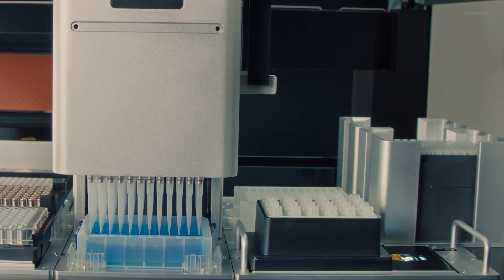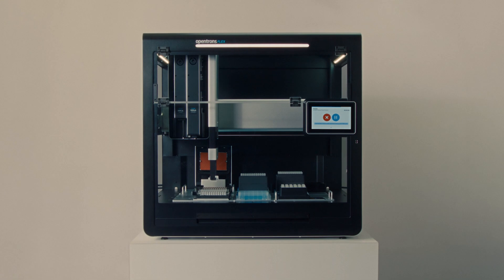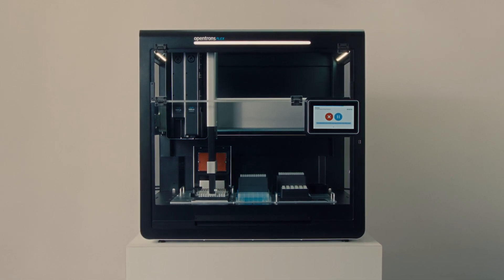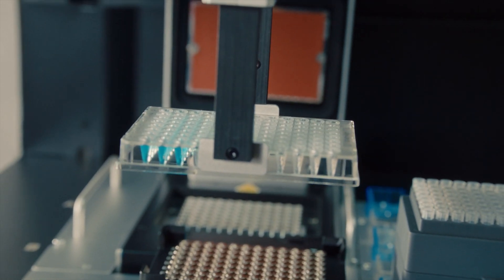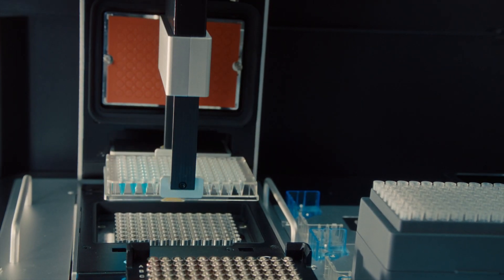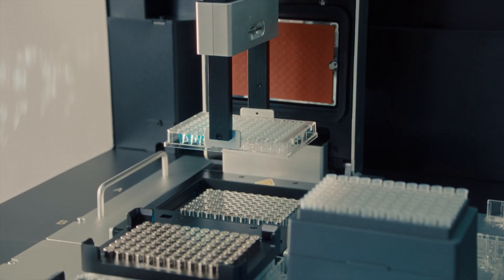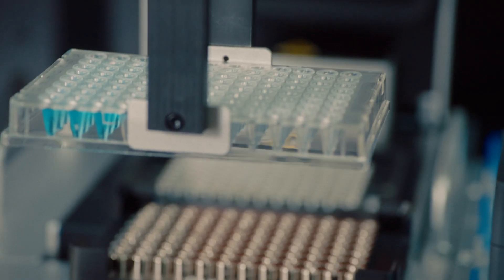There are a lot of features that enable a higher walkaway time and higher throughput. One that is probably important to call out is the gripper, so you are able to move plates or other labware from module to module as your protocol requires it, and you can feed additional tip racks to increase the throughput needed for your particular protocol.